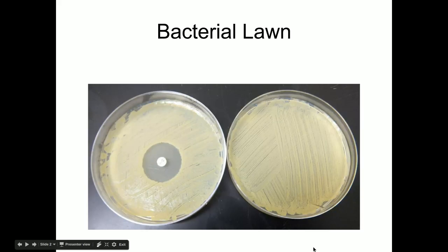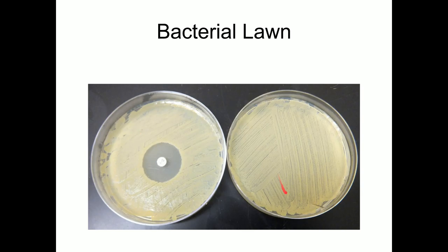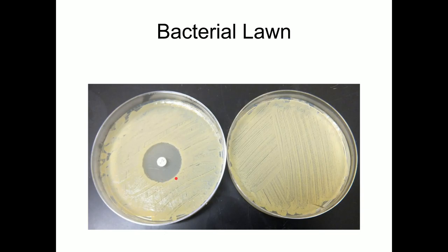These are pictures of a bacterial lawn. On the right side of the screen is a complete lawn all the way across the plate. The left one also has a lawn, except in the middle there's a clear zone of inhibition, because this experiment used an antibiotic disc which killed the bacteria around it. So that's not part of the lawn, but everything else is.